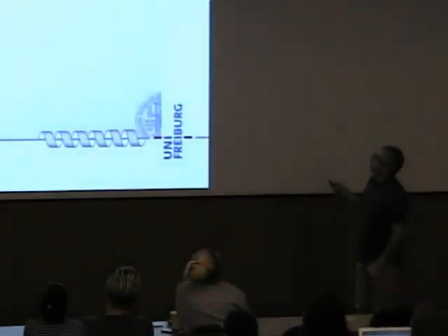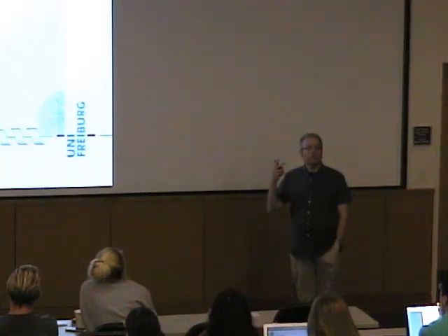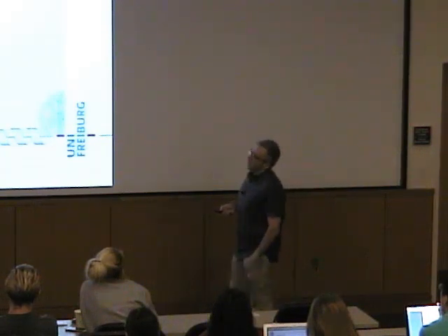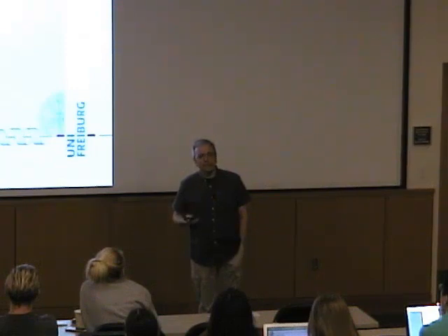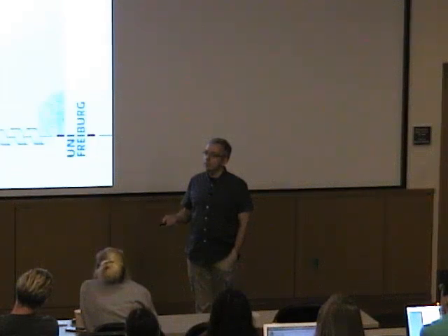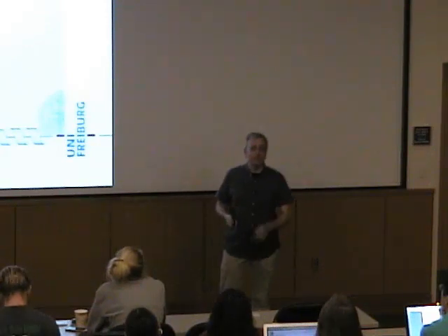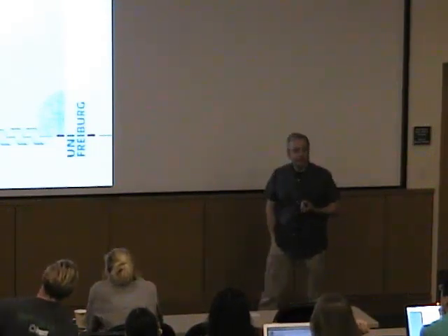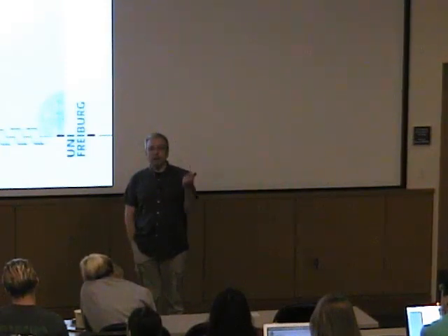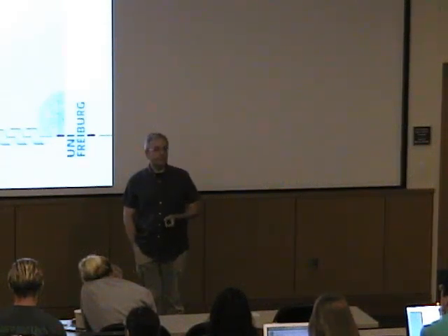So, phase calculations are possible, and there are two general ways of doing this. One is kind of the easy way, and that is that you just say, well, okay, it's not like we're solving the first structure ever here, so there may be structures out there that look reasonably similar to what we have. Maybe because what we're just trying to look at is just a point mutant of a protein that we have already solved half a year before. And then you can, in fact, go and calculate phase angles from a known structure and combine them with the amplitudes of your own structure and calculate an electron density map there.